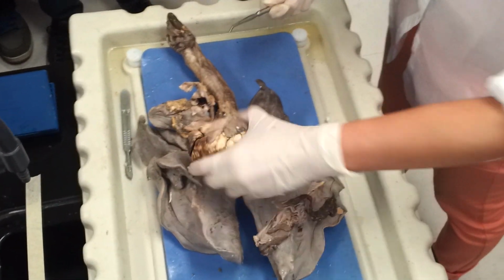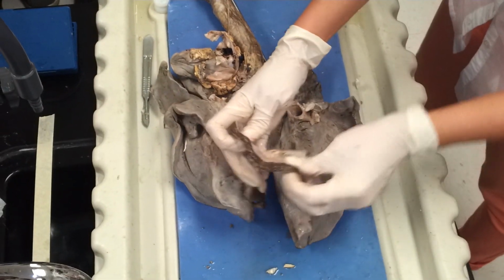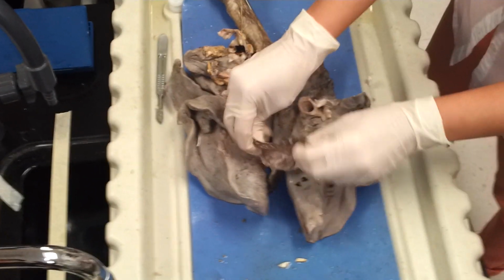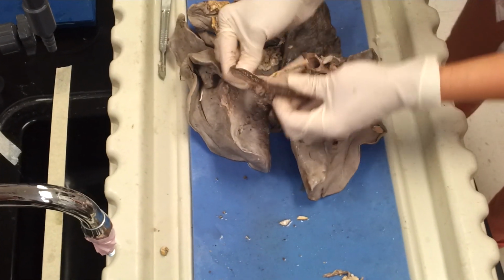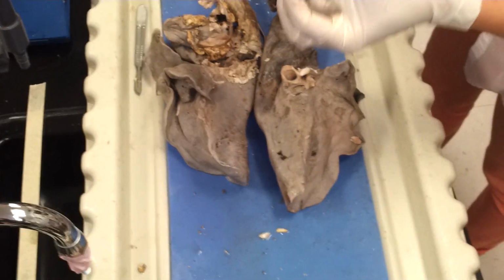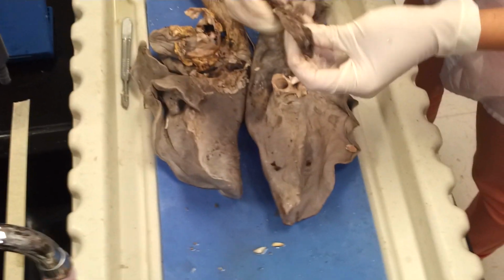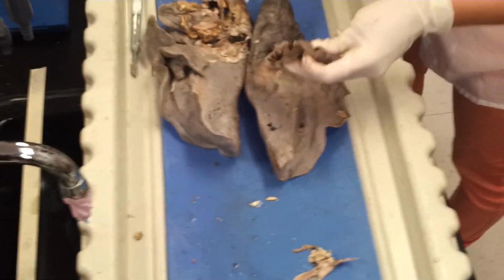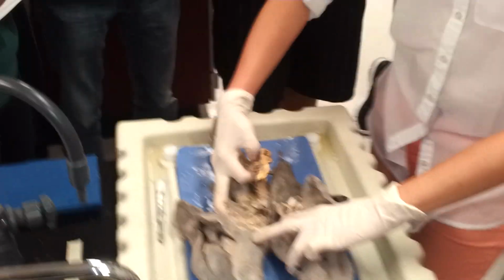Okay, so we take the heart out. And then we have this thing that's connected down here. What is this? Diaphragm. Yeah, diaphragm. So the diaphragm is going to look like well done steak. Do you see that? Like this. Do you see it? Okay. So if we slice that out, then we had all this connected, right?